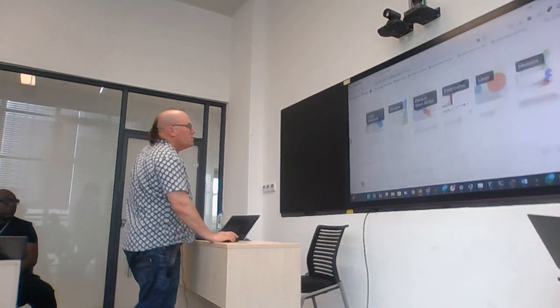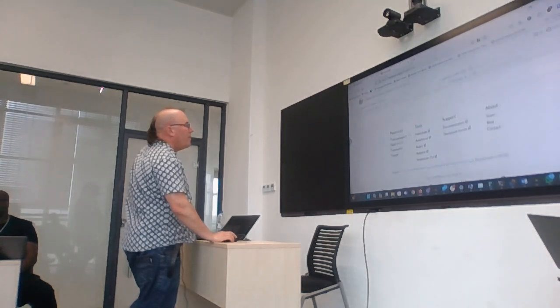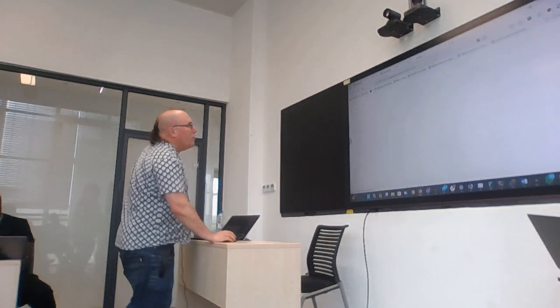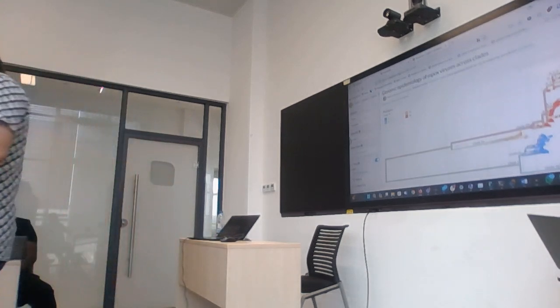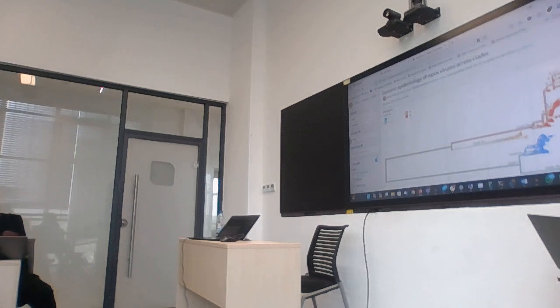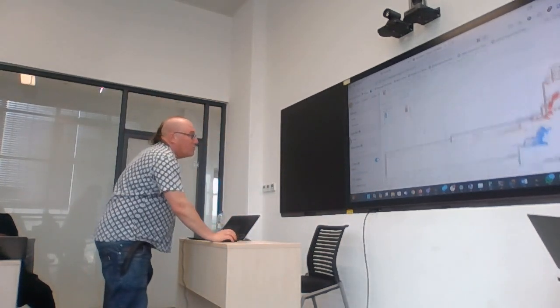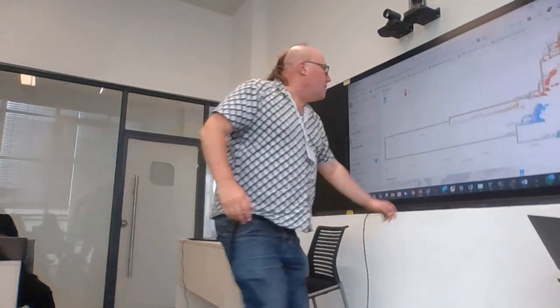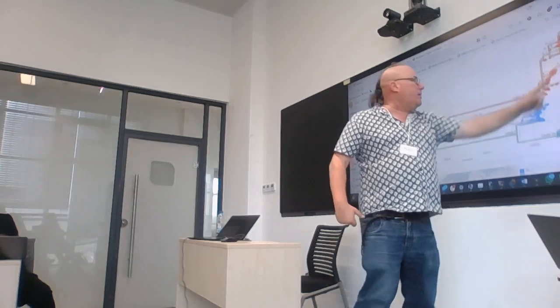Where's my Mpox? I'm just looking at all of the Mpox. Just remembering the terminology, because by now we all know what a Delta is and a Beta and an Omicron and all of those kind of things. This is what the diversity of Mpox looks like. Clade 2, clade 1, and B.1 is down here.